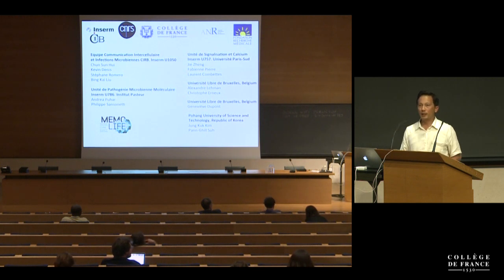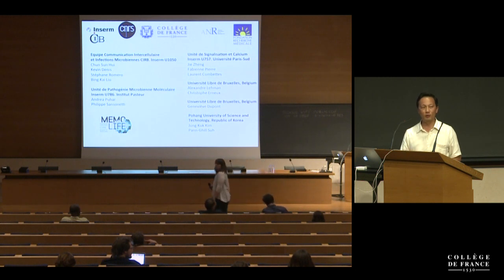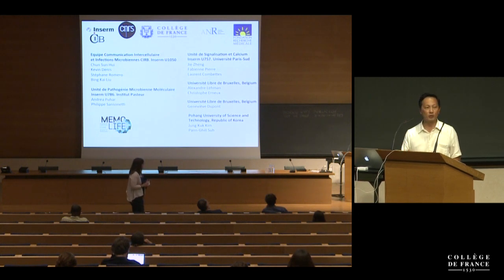Okay, so what we know is that the calcium signals are IP3 dependent, so they have to come from intracellular pools, at least from the beginning. It's possible that afterwards the influx plays a role, but you don't need the influx to have those local, long-lasting calcium responses. Perhaps for the maintenance of those macrodomains, you need the influx, but not for the initiation at least. And that would suggest that somehow there's a component of intracellular pool that is required, and that would be consistent with the recruitment of STIM, the STIM protein, at entry site that we observe.